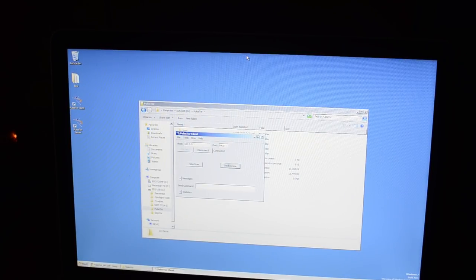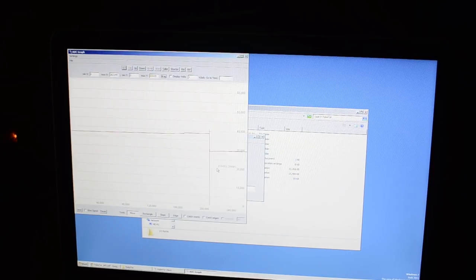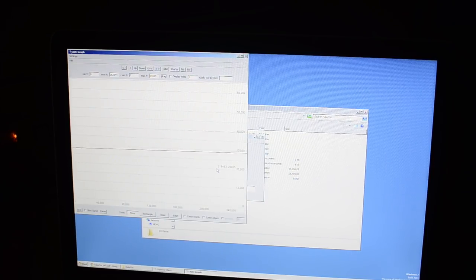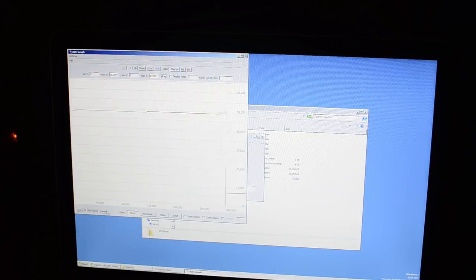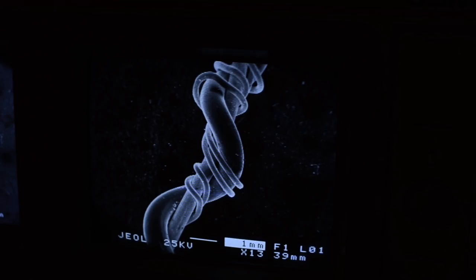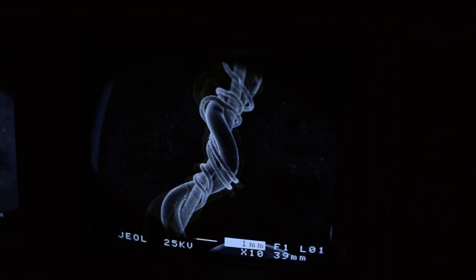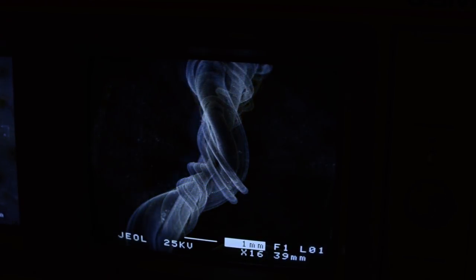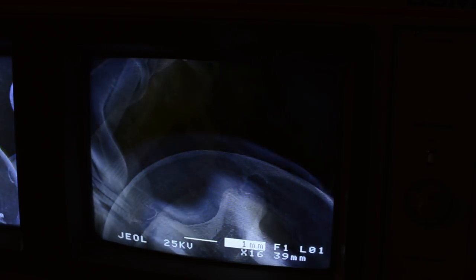And here's the laptop. It's connected through an ethernet crossover to the pulse processor. And we can see that same thing actually on here. Let me bump up the probe current again. We'll find the first thing we want to look at. That's just for scale here. That's a Phillips head screw. I guess we'll look at this wire. And the stainless nut should be up here somewhere.